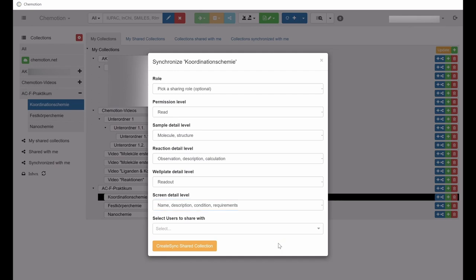The precise meaning of the different options, or the access permission level, will be explained in detail in a separate video.